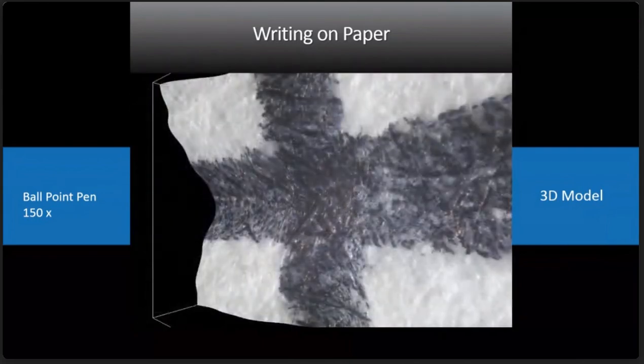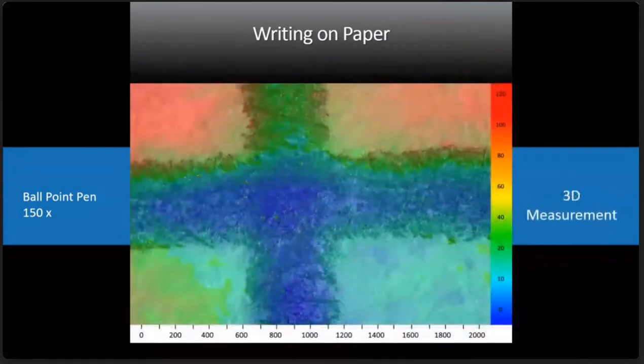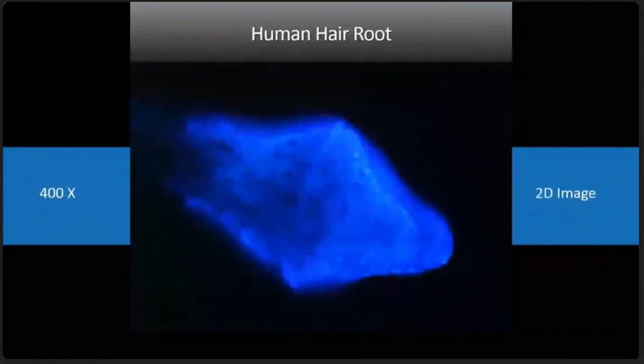But look here, when you see it at this angle, you see even more clearly that the groove from left to right appears to be the second marking. And if you do a color depth map on it, that sort of verifies it, because now you can see the continuous blue channel, blue is at the bottom, going across the screen, whereas the marking up and down has a definite border at the top where it goes green. So the second marking was definitely the horizontal marking, not the vertical marking.